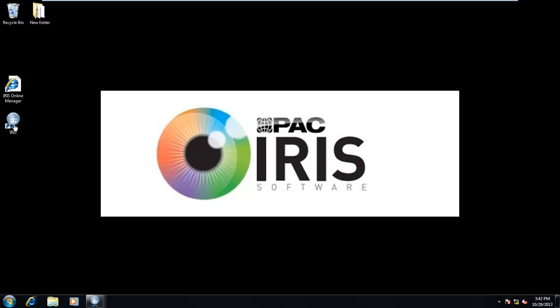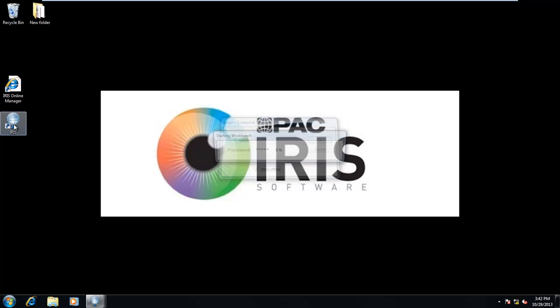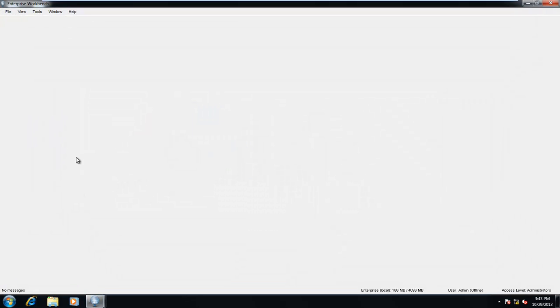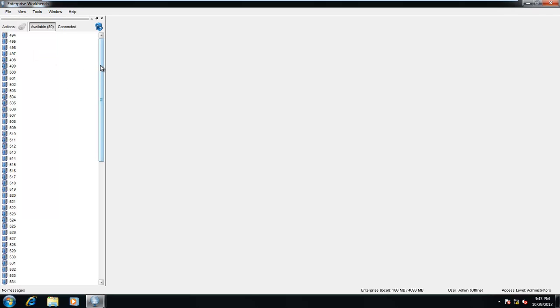To begin, we will launch our IRIS workbench utility and authenticate with our username and password. These are typically set by lab management and can restrict each user to particular tasks, essentially giving our customers an extra layer of security for methods and data. Once our authenticated user is into the system, we will elect to view all instruments on our network and select the plug-in we wish to work with. In this example, we are going to choose a PMD110, or portable micro-distillation unit from ISL.